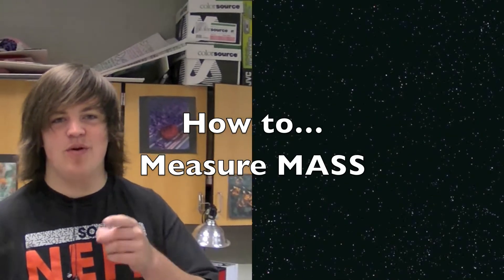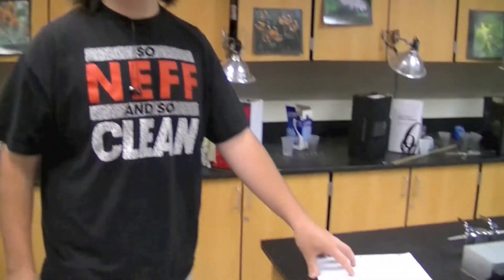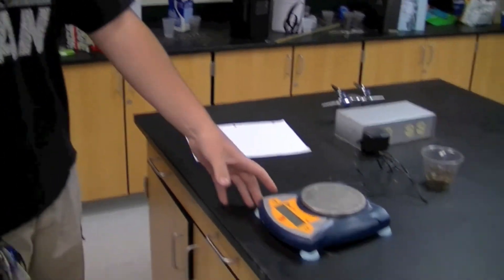This is how to measure and record mass. To do this, we're going to need two things: a weighing paper and a paper to record your data. Also, you're going to need a scale.